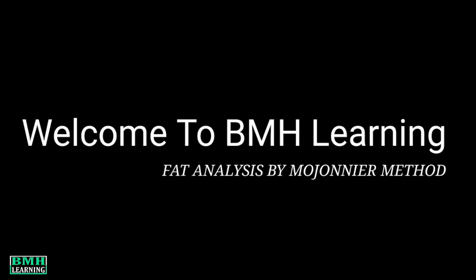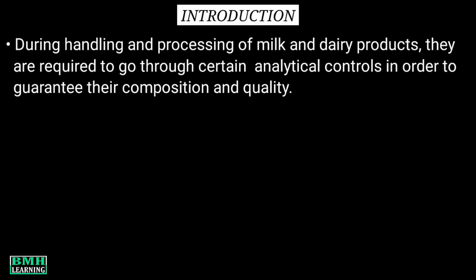In this video, we are going to discuss fat analysis by the Mojonnier method. Introduction. During handling and processing of milk and dairy products, they are required to go through certain analytical controls in order to guarantee their composition and quality.